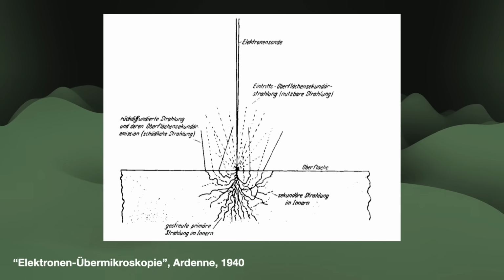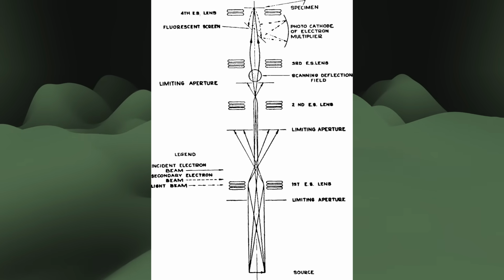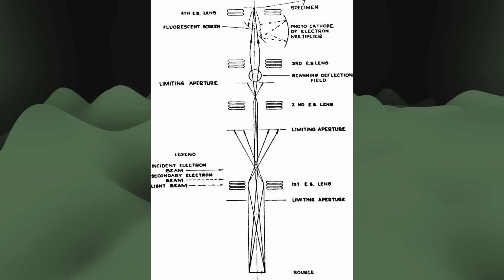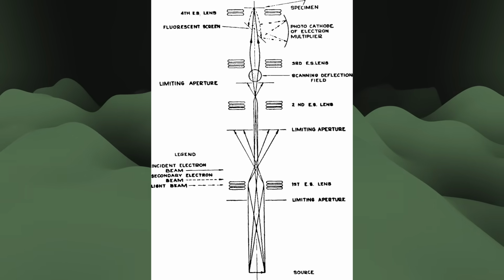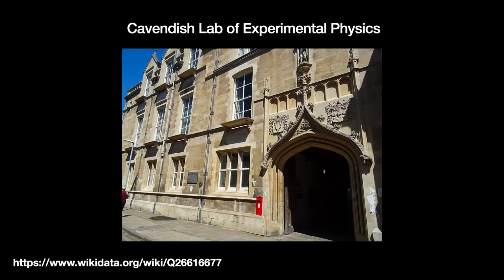And how can you collect more electrons? Well, if you recall from the original RCA SEM, electrons from the sample are run through lenses and accelerators before hitting the multiplier and then the detector. We lose some of them by doing this. So what if we just send them right into the multiplier instead? There are also possible improvements using technologies developed during the war, most notably an electron multiplier that Oatley felt might be better than RCA's.